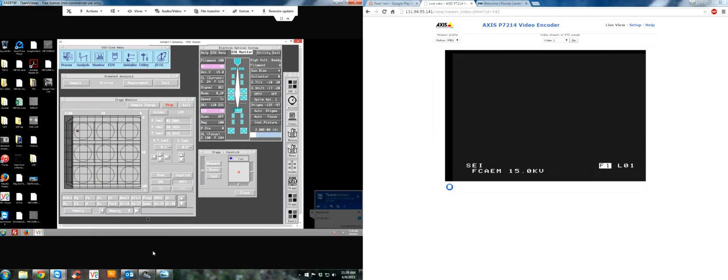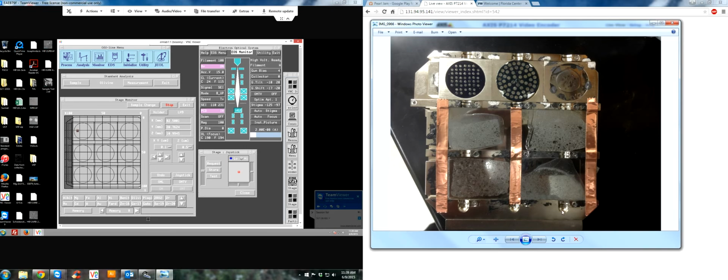And normally we would provide you a picture of the sample holder, which is right here on the right. In this case, in this location, this is EMS1, and on the right is SPI2. However, currently loaded on the 8900, SPI2 is in this location.